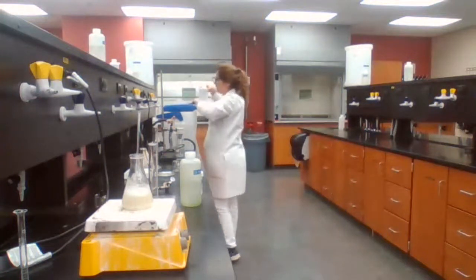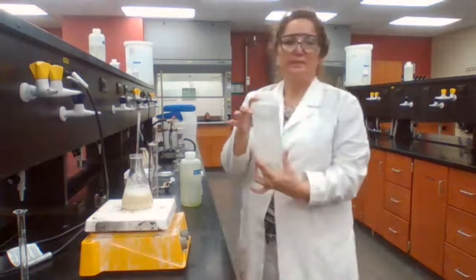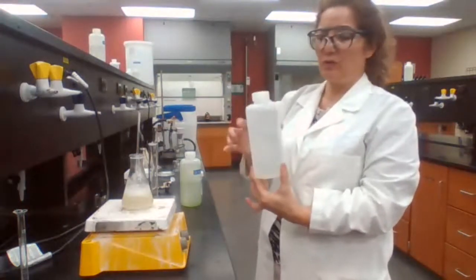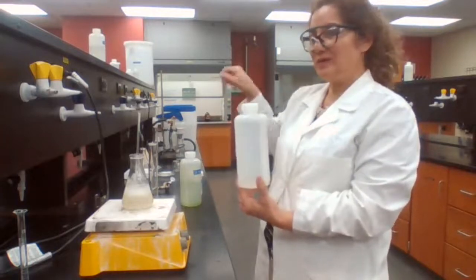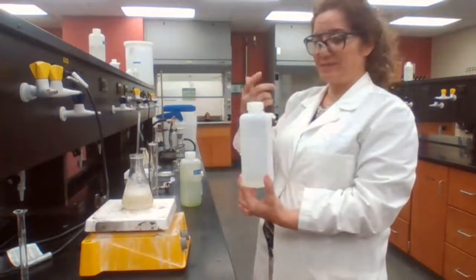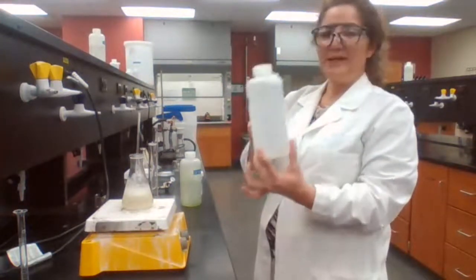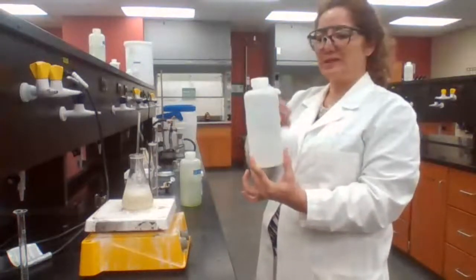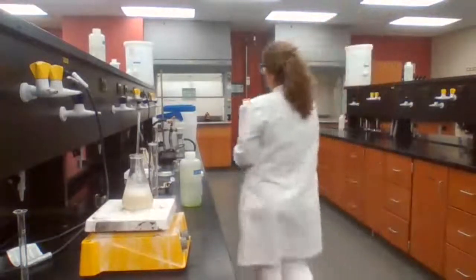I also need cold water for later. I need the ice bath for my crystals, and I also need cold water to wash the crystals when I'm doing vacuum filtration. So I place a container of water in the ice chest to make sure it's cold enough to use later.